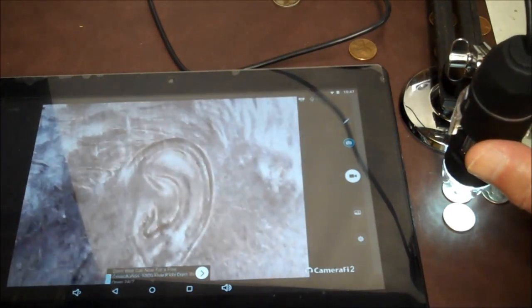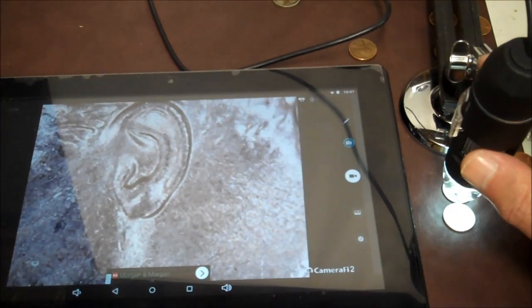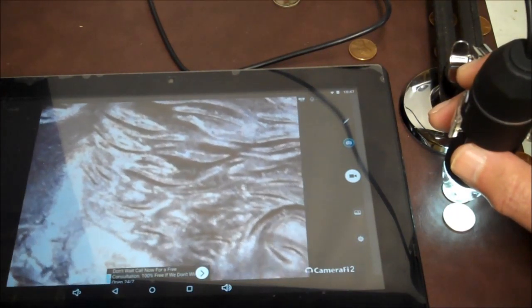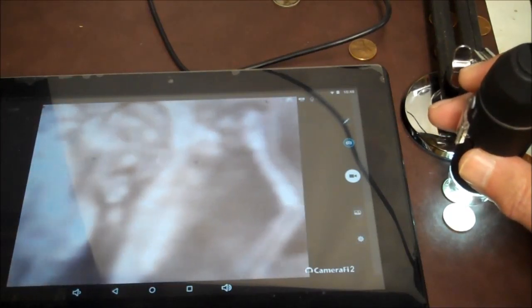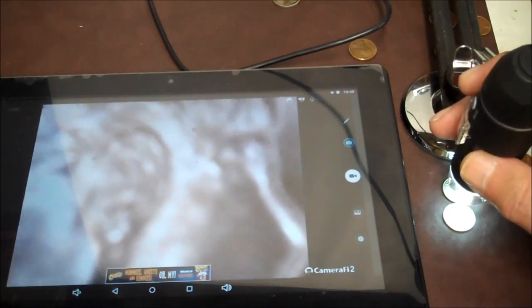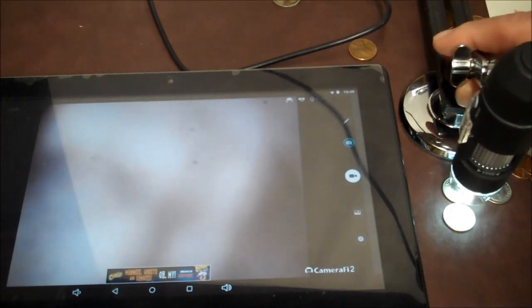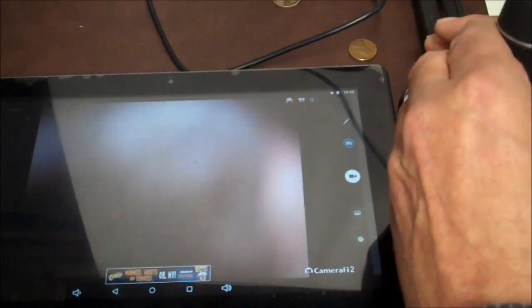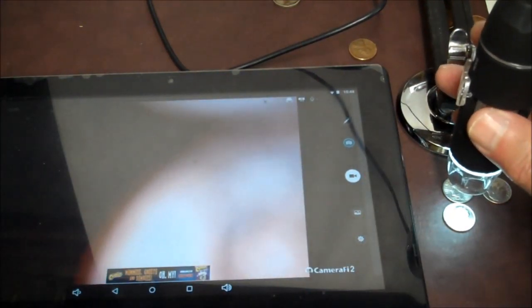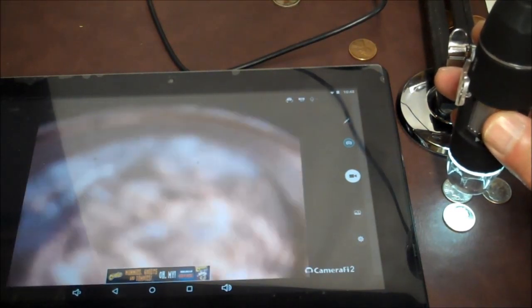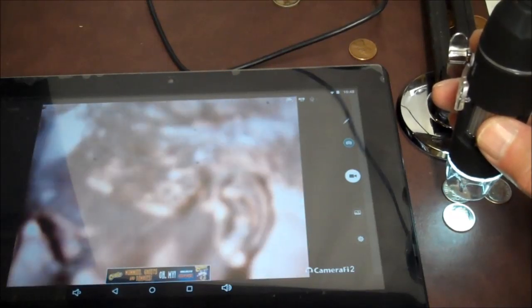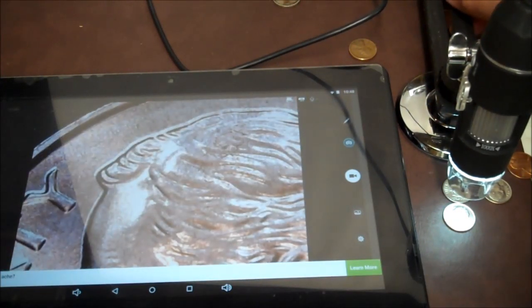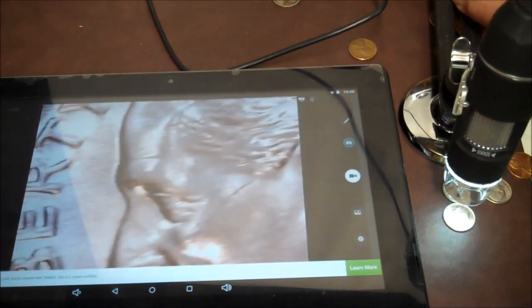Let's see. So there you go. See the ear? So if you're gonna be using it for coins or whatever, it really does zoom in good. But it is cheaply made. And the software that comes with it ain't that great. See now, if I zoom it all the way out like that, I'm basically making it a just a regular webcam. There's a nice clear picture there. That's nice and clear.